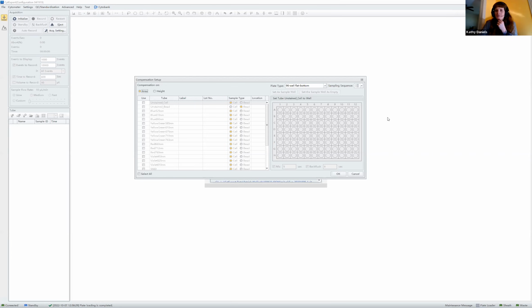Now, what I'm not going to do is change my zoom ratio, because that seemed to have caused everything to quit before. So let's go back into the trick that I mentioned before, right?